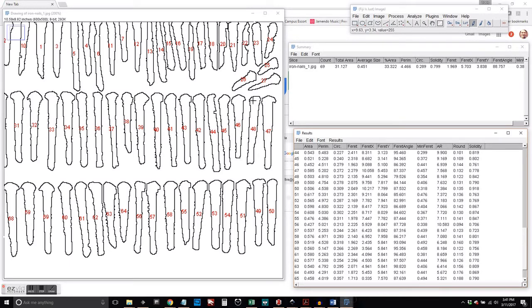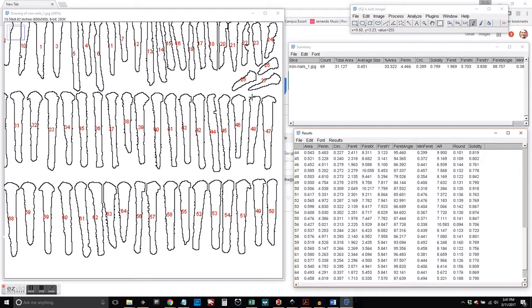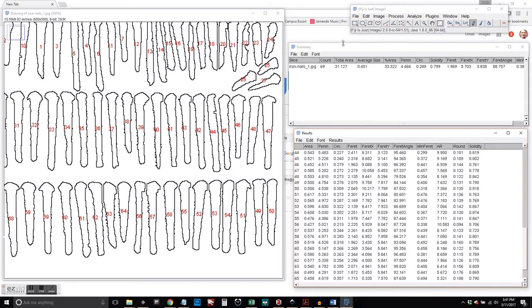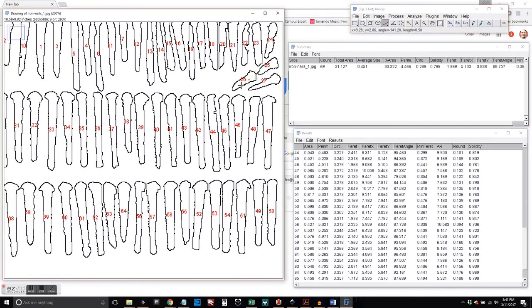When somebody goes through in the lab and just counts all the nails, we have to assume that they got it right. One of the beautiful things about this computer-assisted morphometric analysis is that we have redundancy. We've got this image. If we save it, somebody can go back and double-check and make sure, hey, yes, there were 69 objects in that image.